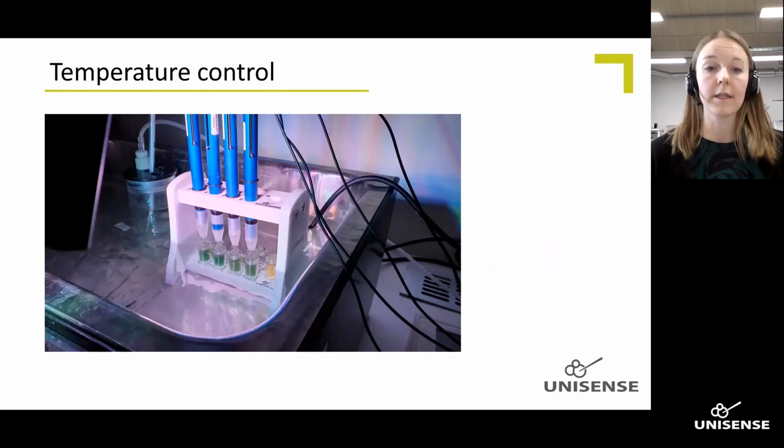The system is designed to be submerged into a water bath to have temperature control. So the whole system should be completely covered by water, and then you have temperature control. Today, when I do the demonstration, I will work here on the table, but only so that you can see what I'm actually doing. In real life, you should make your measurements in a water bath.